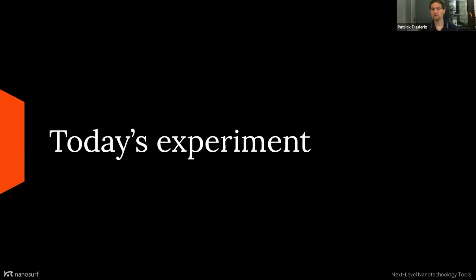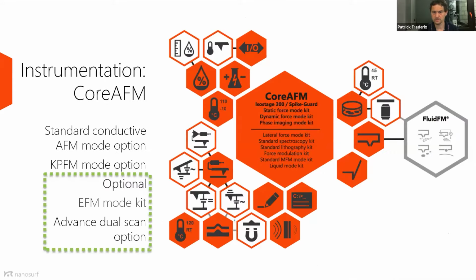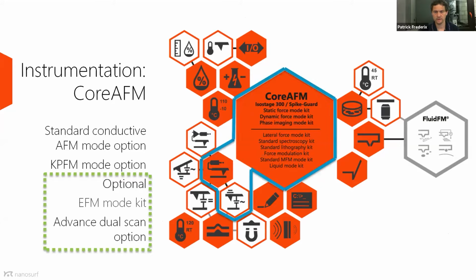So let's get to today's experiment. Today I'm using the CoreAFM, which you see here. And this CoreAFM has a wide range of application possibilities. For the KPFM experiment, I'm using, of course, the Core, which has active damping, static, dynamic, and phase imaging modes present, also lateral force, standard spectroscopy and lithography.